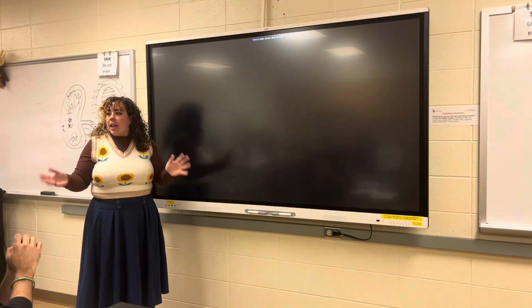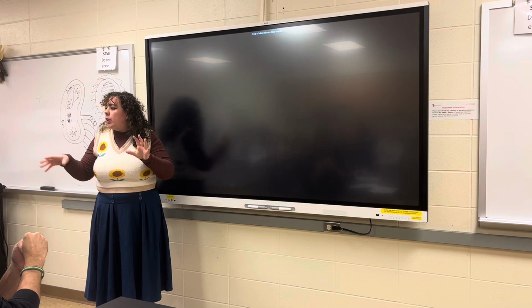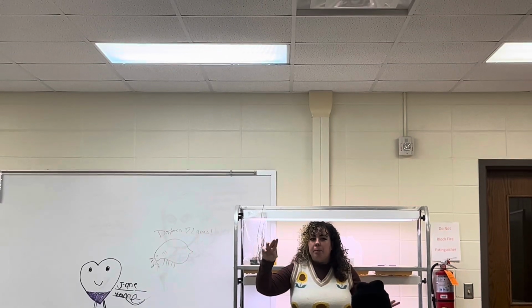With that, you guys can go ahead and get started. You guys can work as a table or in pairs, whatever you guys prefer. Oh, these are the focusing needles. These are sharp, so please be careful. Don't poke your lap or anything.